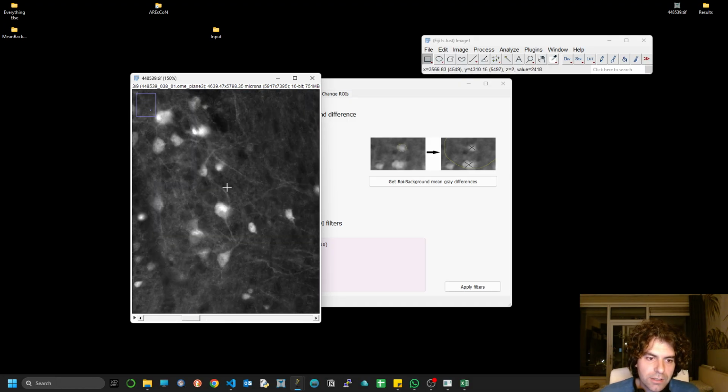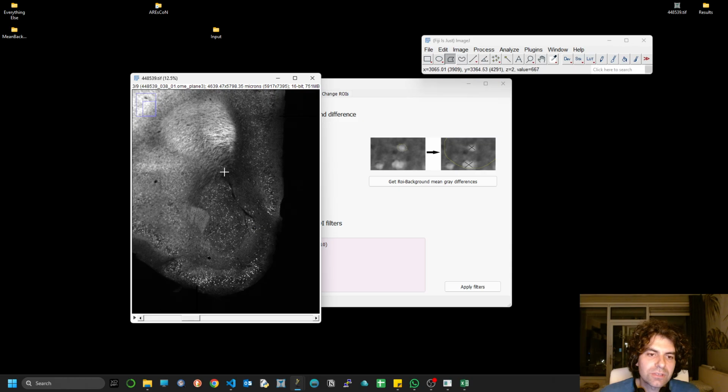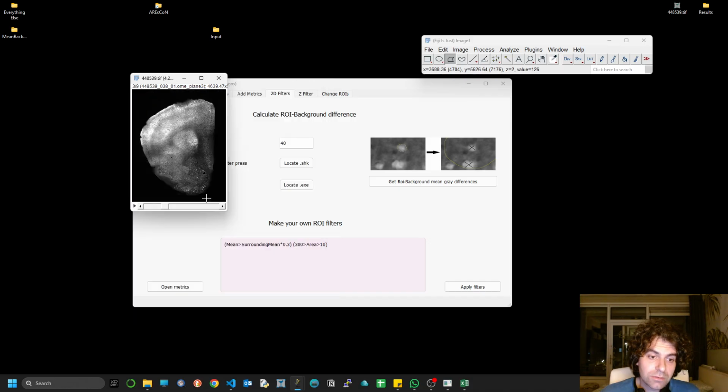This looks like a quite big neuron. If it's just one, it seems like it's just one. And I will go a bit further than that, because it can also be that somewhere across the image you have something which is even bigger, maybe a bit slightly bigger. Okay, now it's certainly big, I would say.